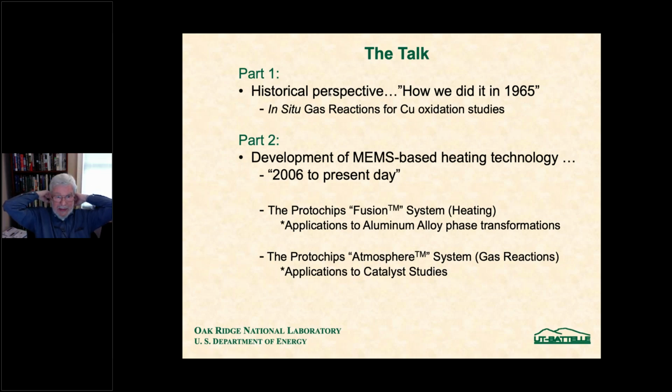So I'll be talking about in situ gas reactions to start with, primarily for copper oxidation studies, and this is going to be historical in nature, to show what the lead up was to doing these kinds of studies, and then how that factored into my getting involved with Protochips about 40 years later.